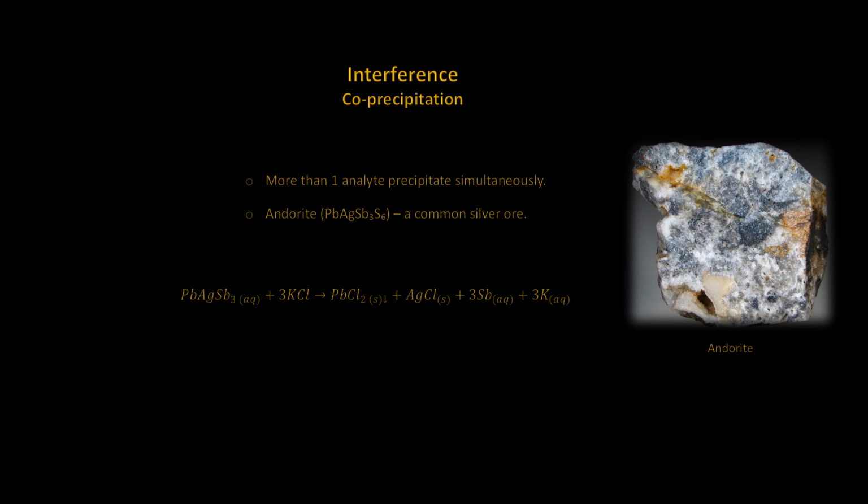After pulverizing to -200 mesh, the sulfur is roasted off and the silica removed by the use of hydrofluoric acid. After the hydrofluoric acid is removed by evaporation with nitric acid, and additional nitric acid added for solubility, hopefully all that's left is nitrates of silver, lead, and antimony in solution.